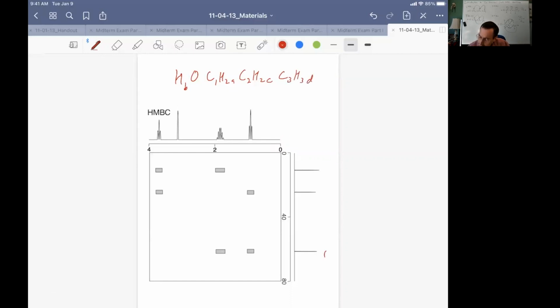And again, I'll number, I do so rather slavishly, number all of our carbons, letter all of our proton resonances. And now we get a lot of cross peaks. And you'll notice that 2 is crossing with D, and 1 is crossing with D.